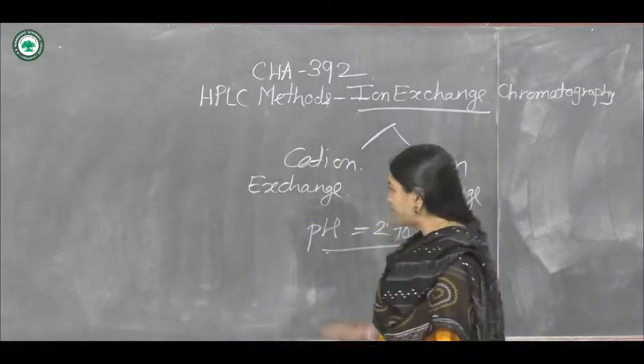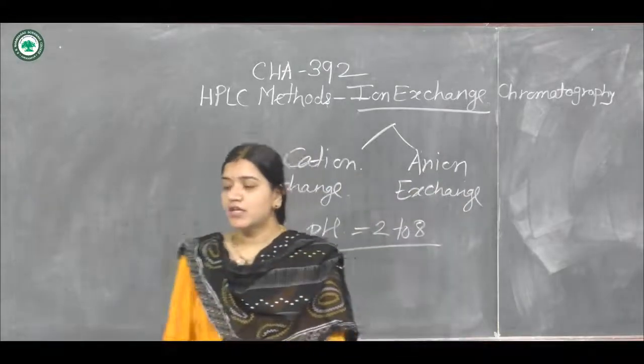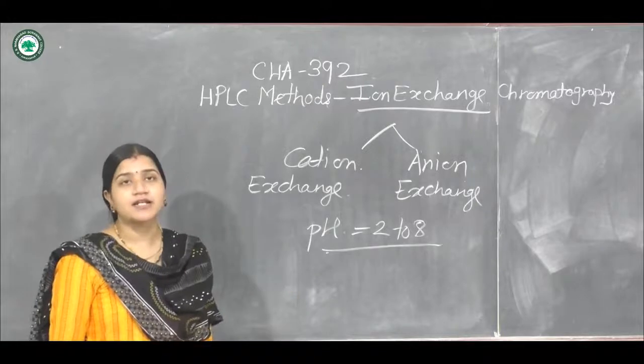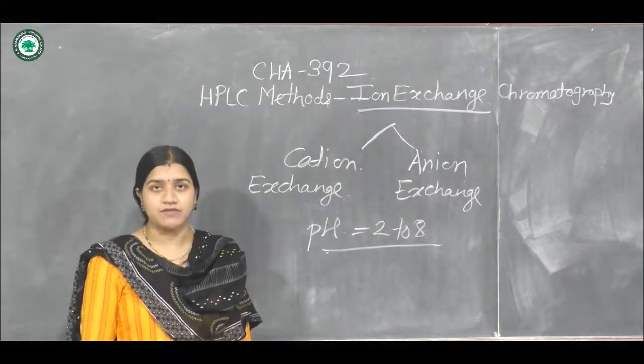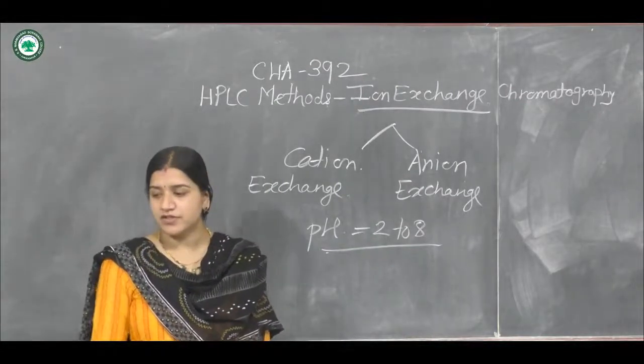Now, this pH range directly affects the separation as well as the retention behavior. How does the pH of a substance directly affect the retention behavior?